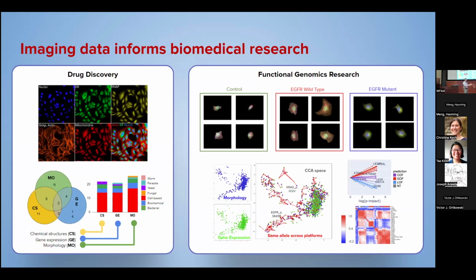The only thing that biologists have to do is to prepare a high-quality sample, which is put under the microscope, and then collect images out of that. And it turns out there are robots that can do that, and many biological labs have that automated as well. So creating the samples is becoming easier and easier.